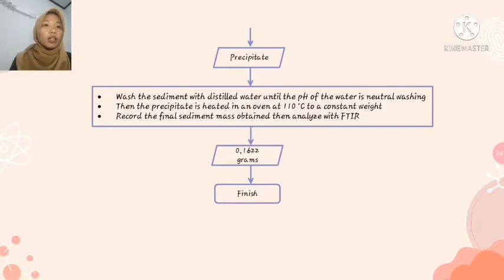Method 2. Take 2.5 grams of calcined dried mud and place into a 50 milliliter beaker. Then add 15 milliliters of 2 molar hydrogen chloride solution, and then cover the beaker with a watch glass.